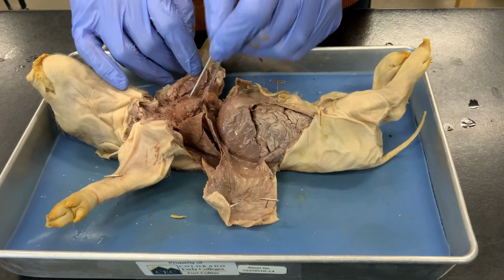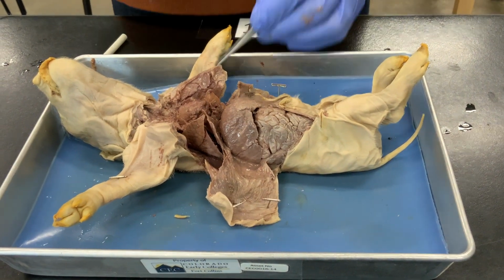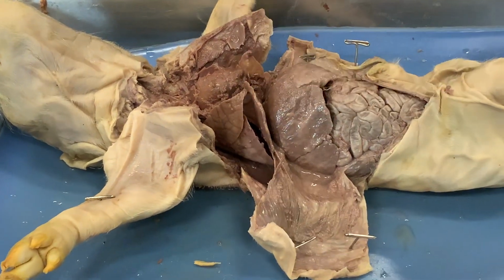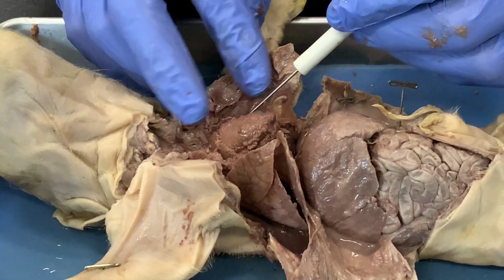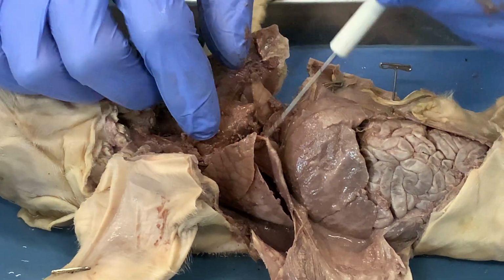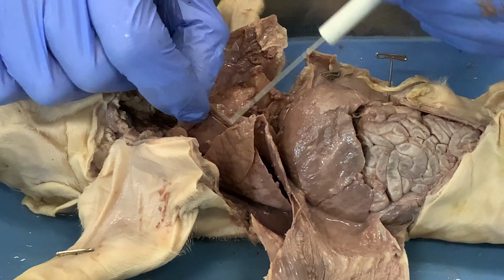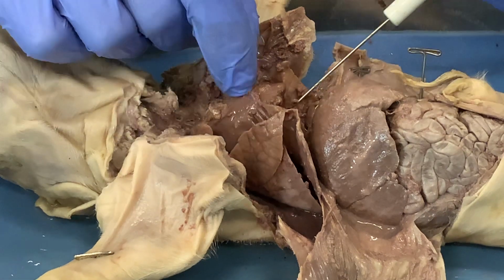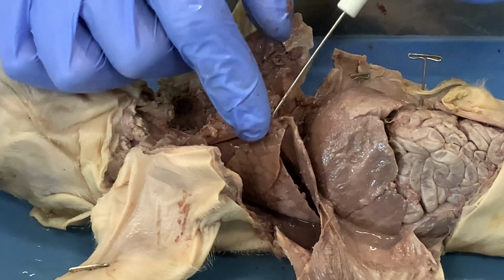In front of that, we have a lung on either side, again, because they do more rapid metabolism and need more gas exchange. The lungs are larger and a little bit more complex than on the frog. And then in the center, again, to support a faster metabolism, there's a proportionally larger heart here, and there is a membrane separating those organs, the heart from the lungs. I've cut the top of it open already so that we can see the heart, but that is the pericardium. It's a barrier to keep any infections from anywhere else in your body from getting to your heart, and that's this membrane right here.